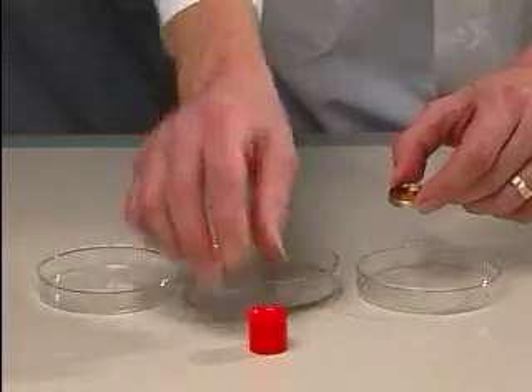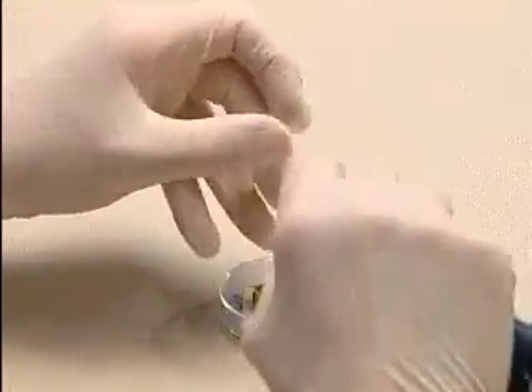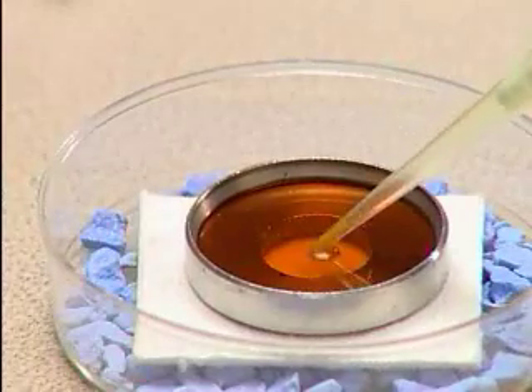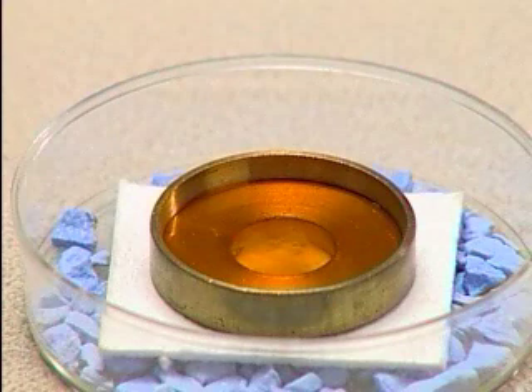Place a macrocarrier inside a macrocarrier holder using the seating tool. The macrocarriers, along with the stopping screens, launch assembly, and rupture disc retaining cap can be sterilized by autoclaving. Gently re-suspend the gold DNA pellet by tapping the side of the tube. Pipette and spread 6 microliters of the DNA-coated microcarriers evenly over the central centimeter of the macrocarrier. The macrocarriers should be coated in a low humidity environment with minimum vibration to minimize agglutination. A suggested method is to place the macrocarrier in the holder into a petri dish containing desiccant. The ethanol should evaporate within 10 minutes and the macrocarriers should be used within 2 hours.